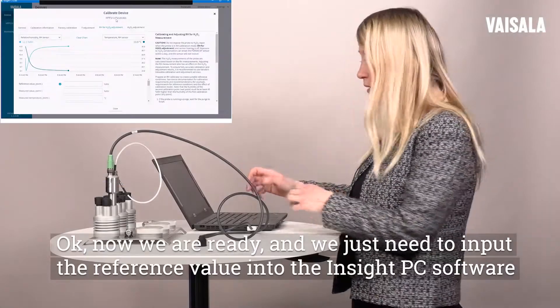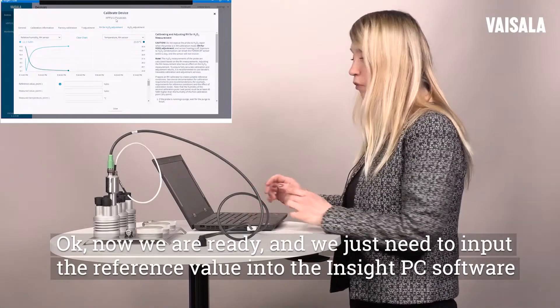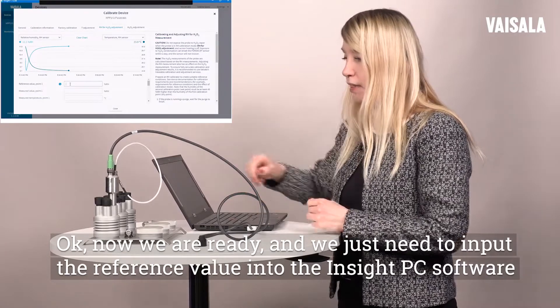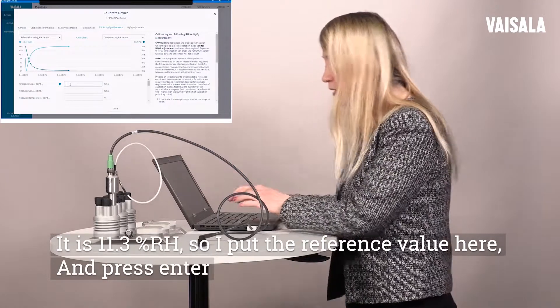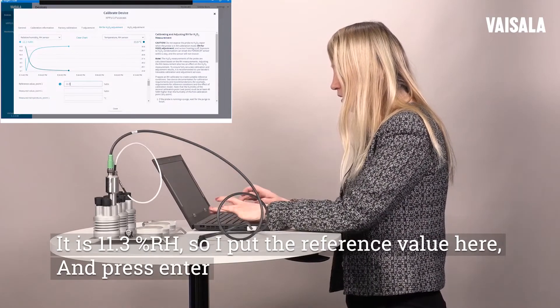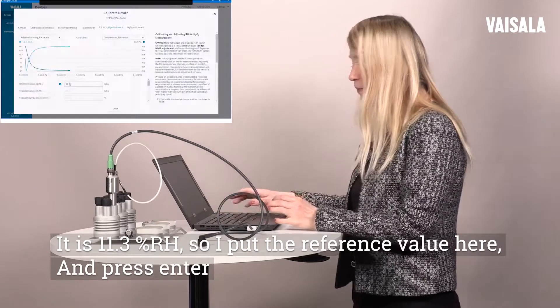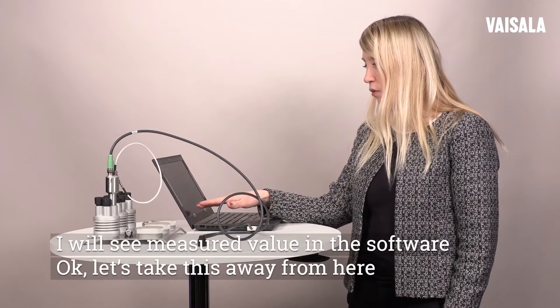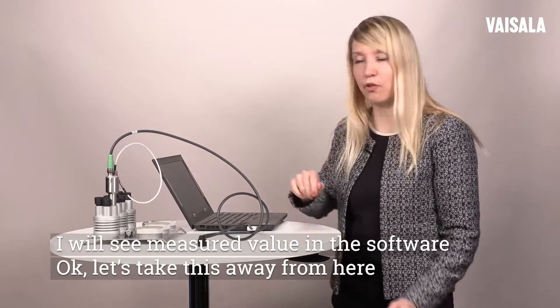Okay, now we are done and we just input the reference value into the Insight PC software. It is 11.3 percent. So I put the reference value here into the software and I press enter. I will see the measured value in the software.